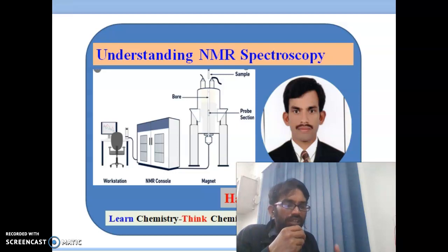explaining 1D NMR spectroscopy, 2D, 3D and 4D, those dimensions of NMR spectroscopy, their explanation and interpretation, we will discuss in the next class. So today we will talk only about the introduction of NMR spectroscopy.